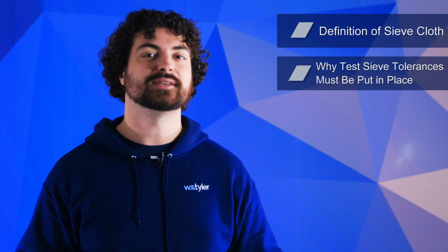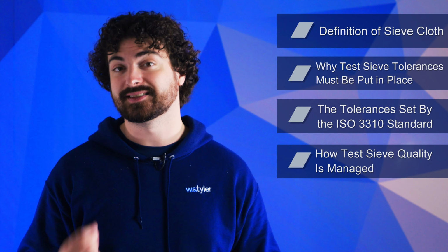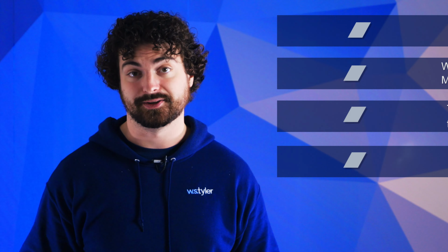So in this video, we'll go over the definition of sieve cloth, why test sieve tolerances must be put in place, the tolerances set by the ISO 3310 standard, and how test sieve quality is managed.